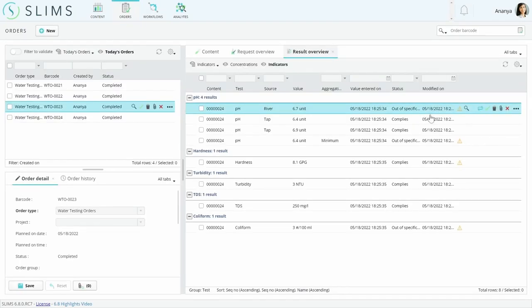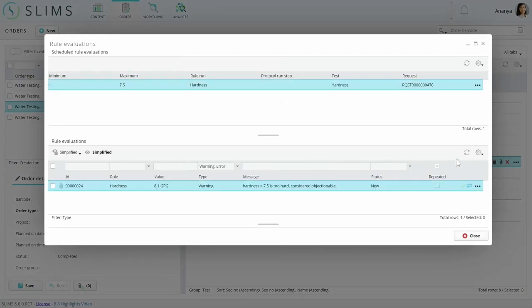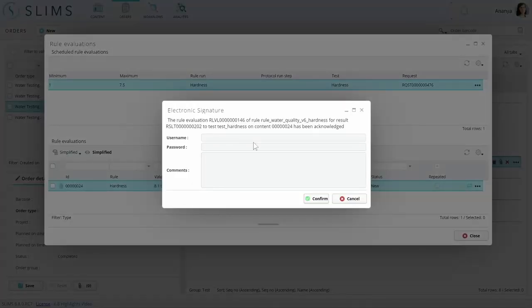Just like before, the results can be viewed in the completed order, and the warnings and errors can be acknowledged by the reviewer.